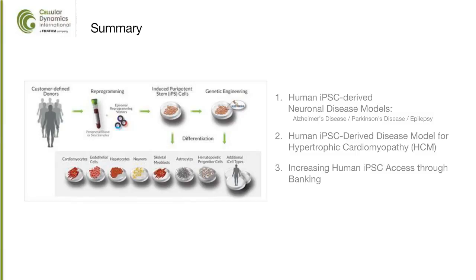However, this is very early in culture, and as we know, Parkinson's is a longitudinal disorder. So maybe if we kept the cells in culture for a really extended period of time, similar to the disease condition, we could see a change. But nonetheless, the altered respiratory capacity of the cells shows that there's definitely a phenotype and it is worth investigation, and obviously something that we would like to look into in the future.